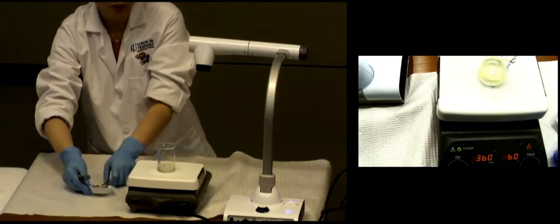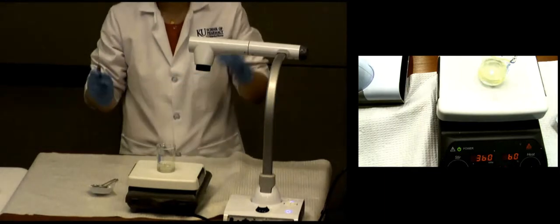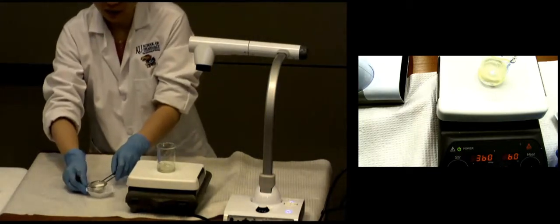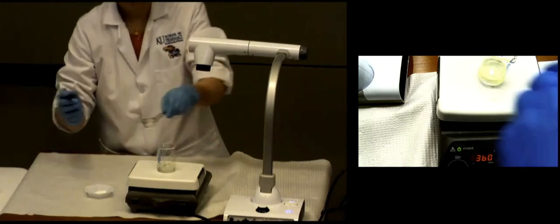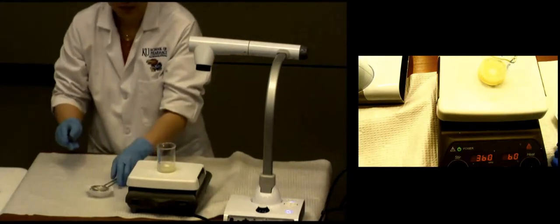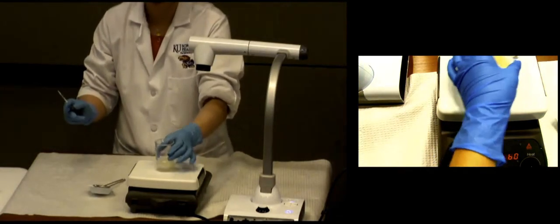So your procedure says medium speed. Technically, you can go even above medium speed as long as you don't cause any spill. All right, you probably want to go a little bit quicker than the medium speed, but don't cause any spill. So we're on step 8 now, and that's where it says a setting of 4 or 60 degrees. You can kind of see that on there. So once melted, turn off the heat, add the stir bar, and begin stirring in the base at a medium rate. Okay, as you can see there, some of the drug actually accumulates on the top of the stir bar.